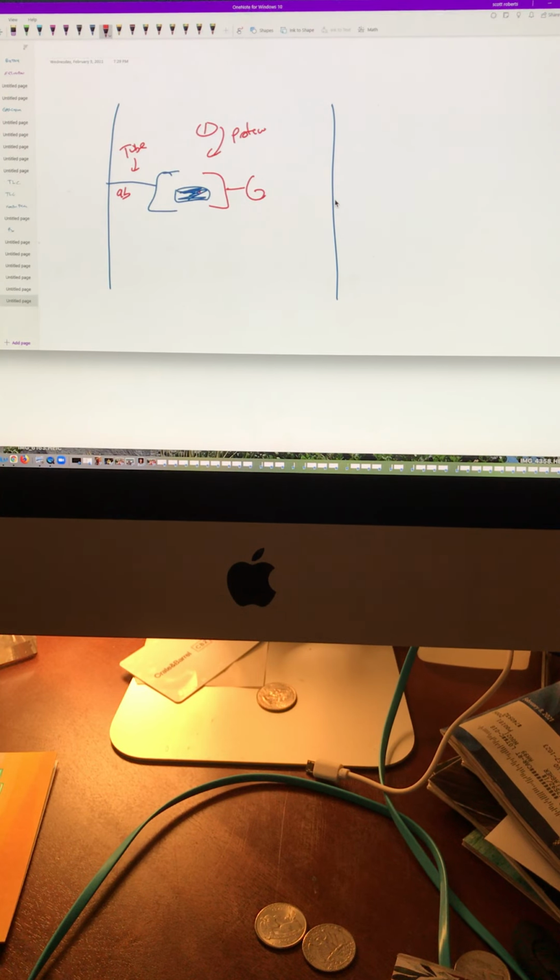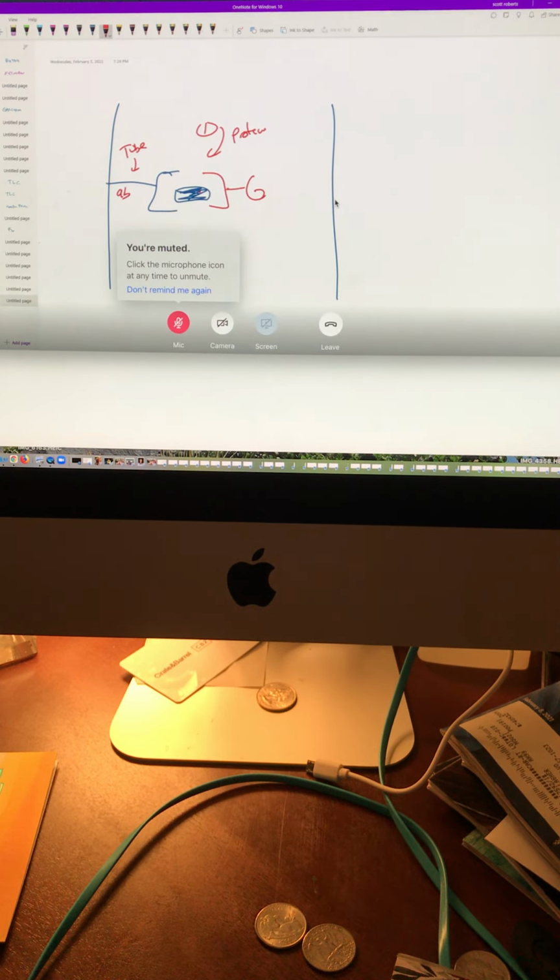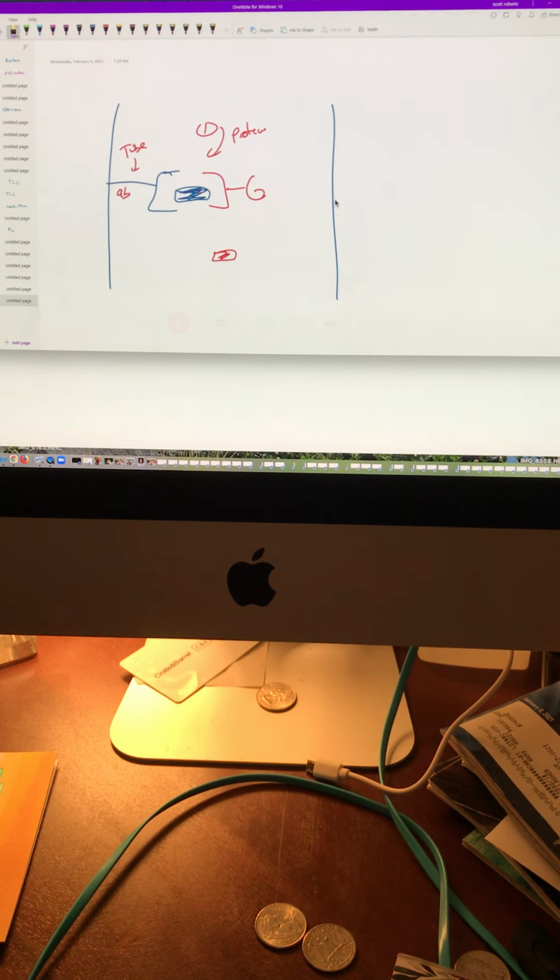Oh, by the way, between every step you wash to get the stuff out of there, because maybe the protein would just kind of hang around and not be bound. You understand? So you always wash. Don't ever forget that. Between every step, you got to wash everything through, so it's just not chilling out here.